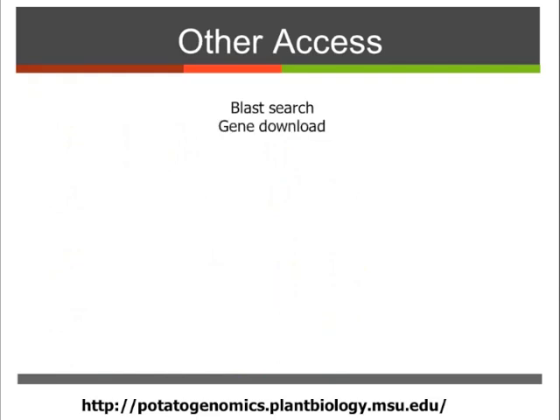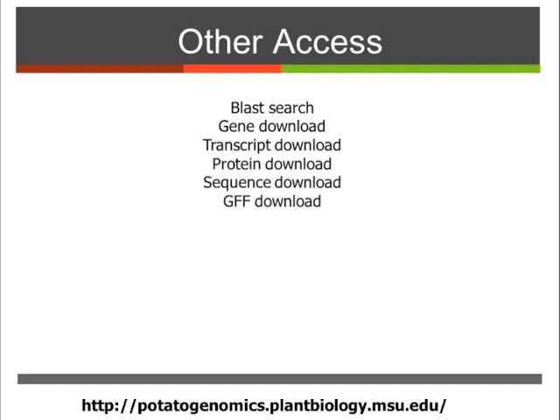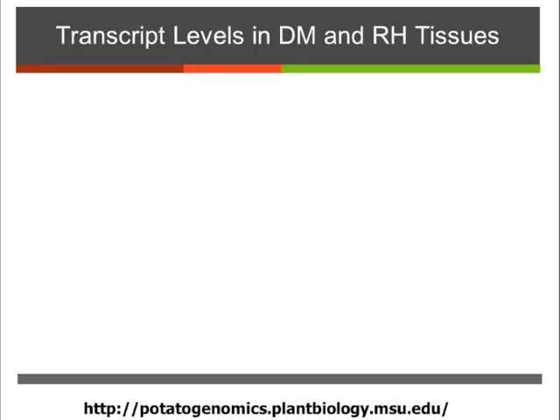So other accesses, there's a blast search. It's supported with all the blast family. You could download everything. You could download the transcripts, and you could download the proteins. Okay? If you want to make your own genome browser, you can do that as well. We provide the GFF.